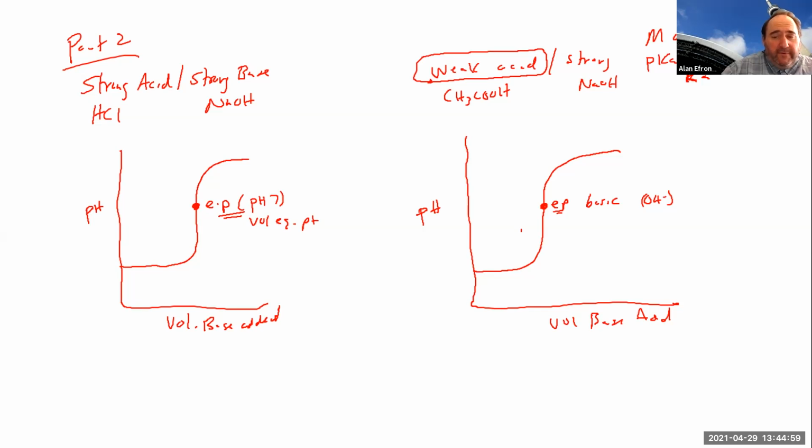So let's talk about first off how we could get the molarity. Obviously, we should expect the equivalence point to be pretty vertical.